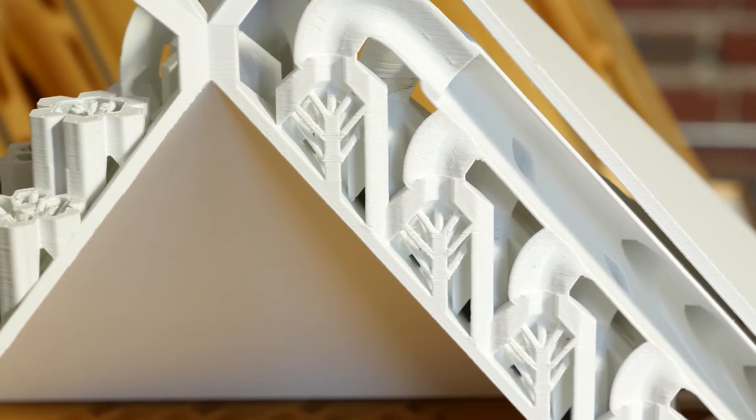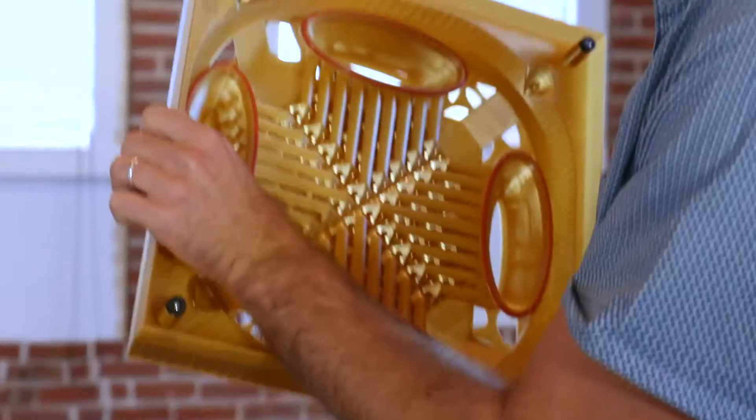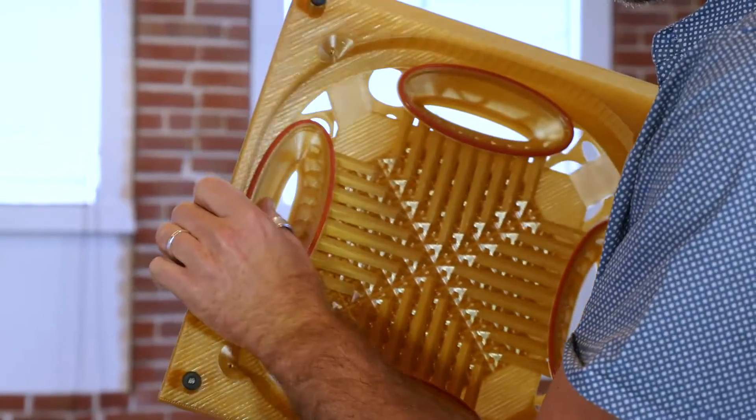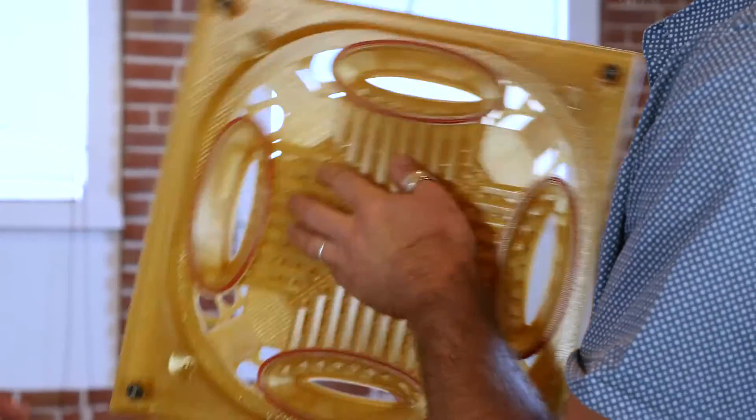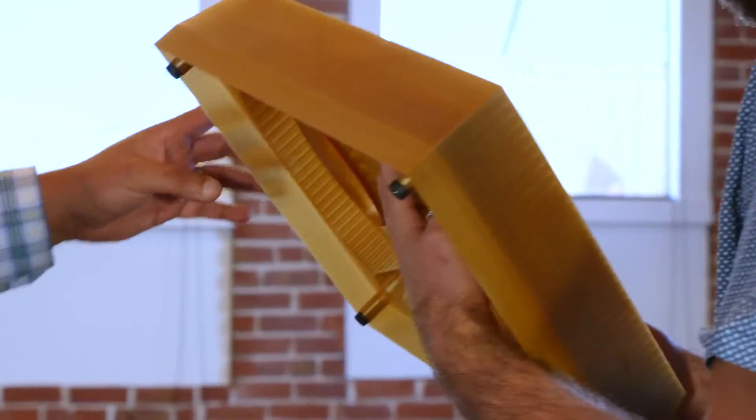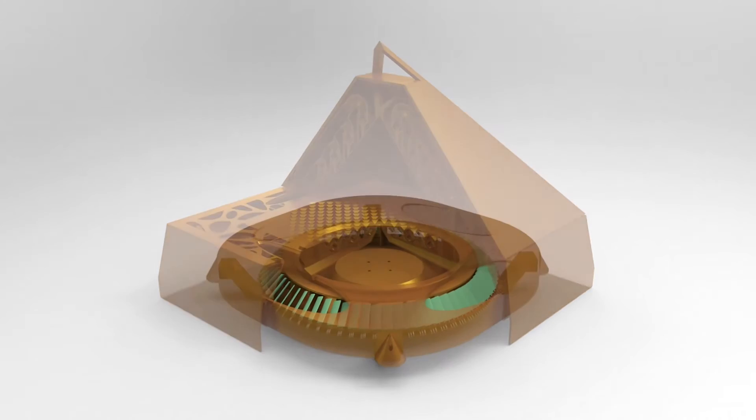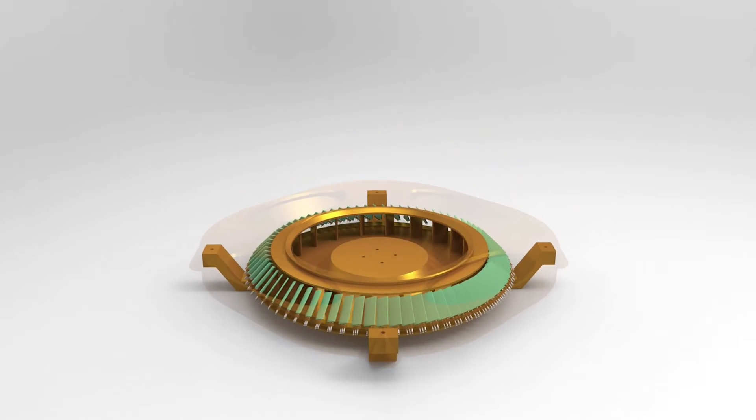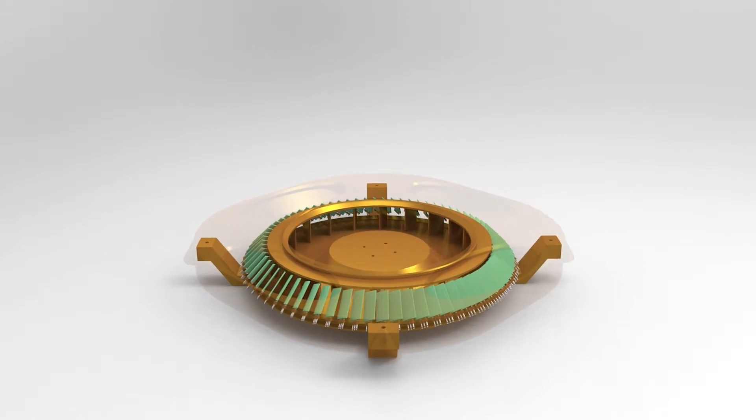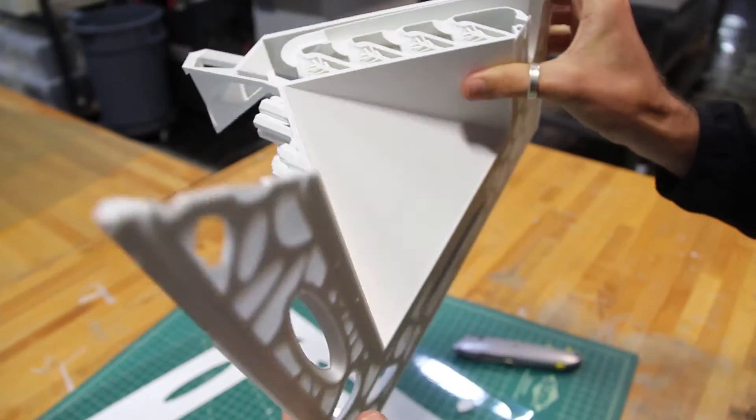On the material side, we used high-temperature thermoplastics from Stratasys, the Ultem 1010. Using that plastic is what lets us heat up this material to nearly 200 degrees Celsius, which is nearly 400 degrees Fahrenheit.